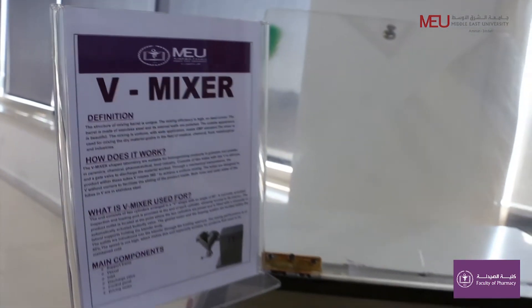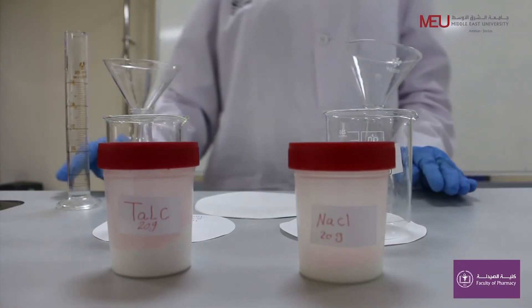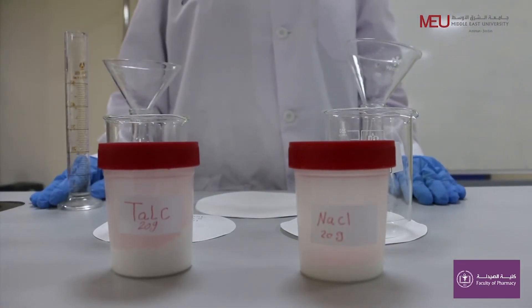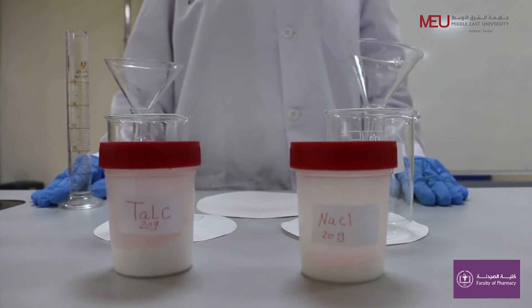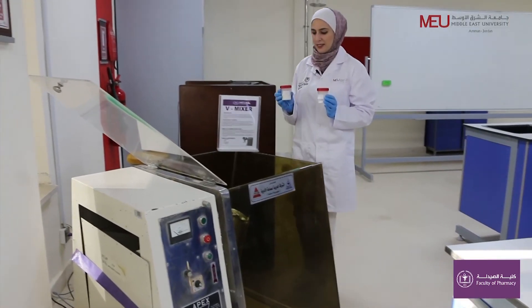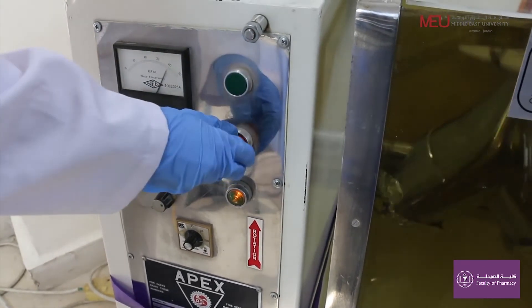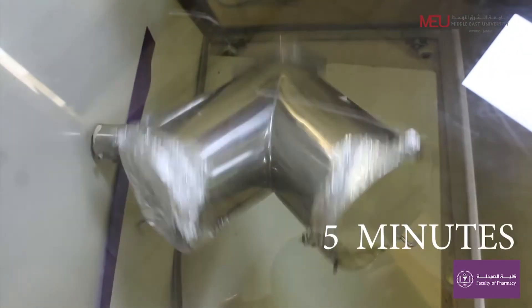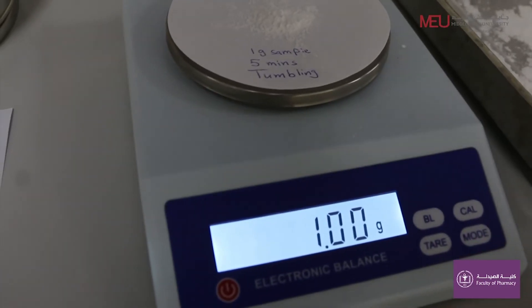Finally, we will start with tumbling. Weigh 20 grams of insoluble powder talc and 20 grams of soluble powder sodium chloride. Mix first for five minutes. Take one sample of one gram from the mixture.